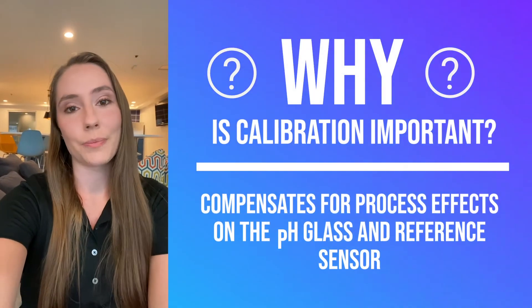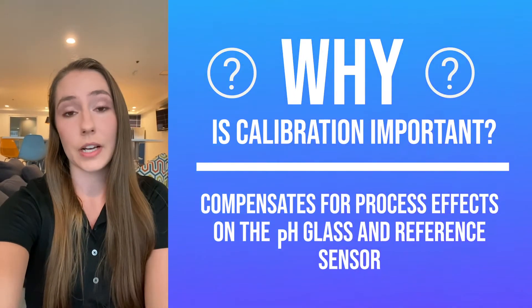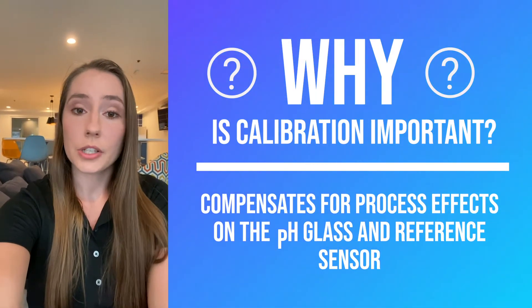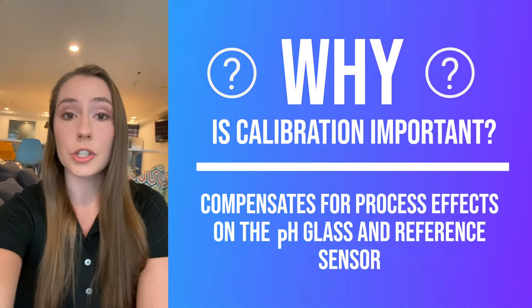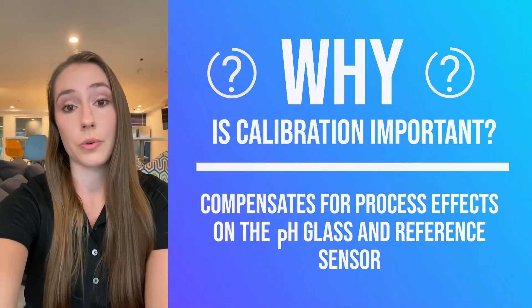Performing a proper calibration is important because it compensates for the unchangeable effects that the process has on a pH sensor, such as an aging pH glass or a depleted reference sensor. This in turn ensures that you are not unnecessarily replacing your electrodes too often.